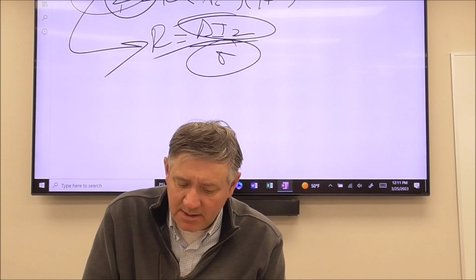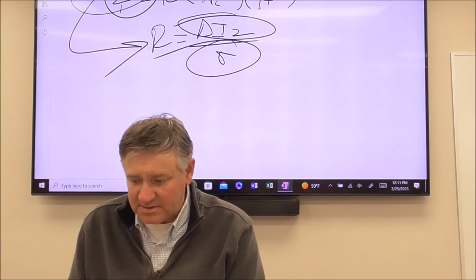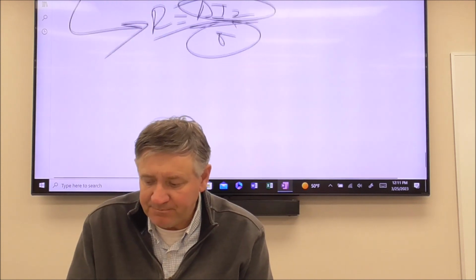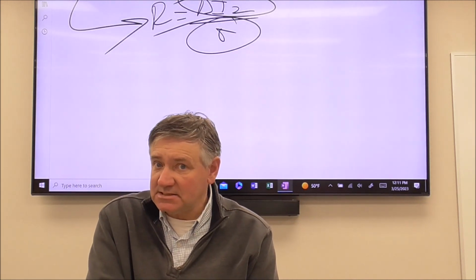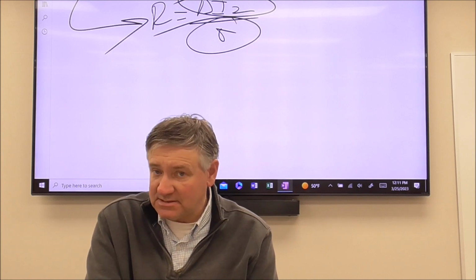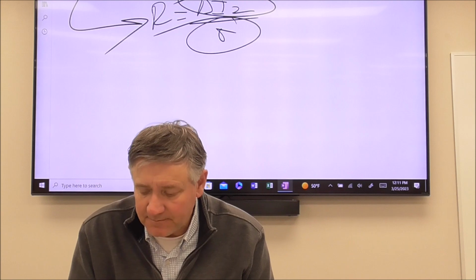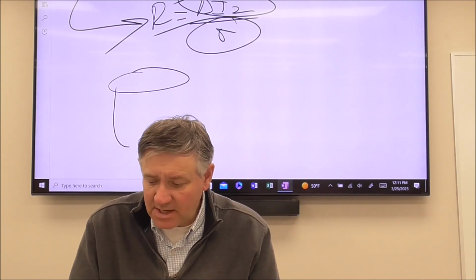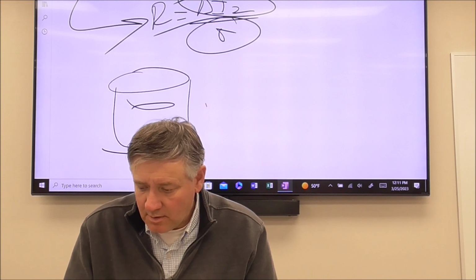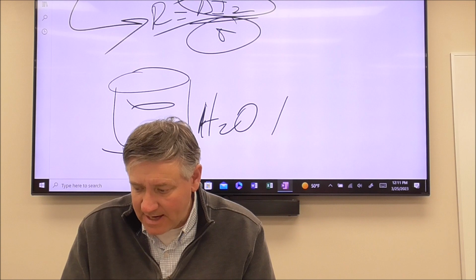So you're going to run the reaction at about 10 degrees Celsius, and then you're going to run it at about 40 degrees Celsius. Now, here's what has to happen. I would run the 10-degree one first, because that's the cold temperature one, and that's going to take the longest. So what you want to do, listen to me. In a small beaker, mix together whatever reaction that you chose, mix together the water, the acetone.